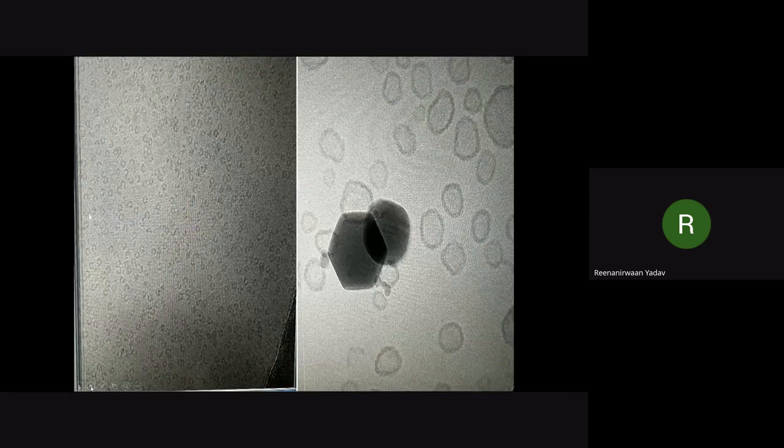These are the ribosome micrographs that we collected in cryo mode. We have 200 kV with the K2 detector. The next micrograph is of a clamp fragment, and these are micelles, which some people use for targeted drug delivery. These are liposomes, and on the right are images of apoferritin.